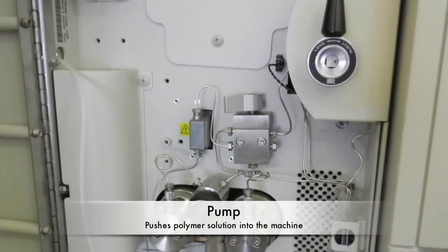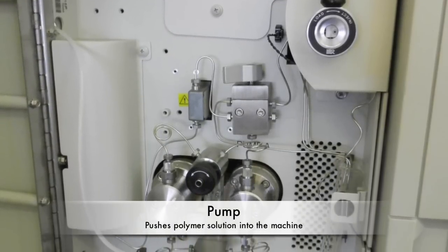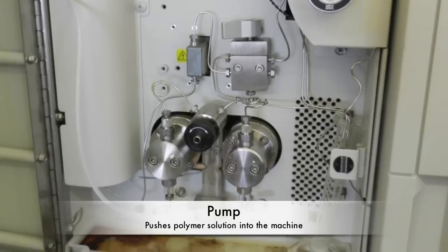The GPC has three main components. First, the pump is used to push the polymer solution and solvent, THF, or tetrahydrofuran, into the machine.